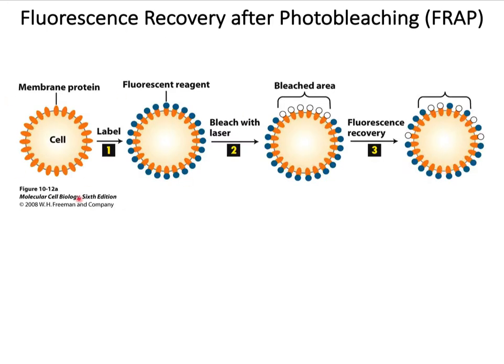This is another example of fluorescence recovery after photobleaching. The cell surface membrane is made fluorescent by a fluorescent antibody or GFP or RFP tagging. See, a section is bleached, and during the recovery, if that protein is motile in the membrane, the fluorescence in that region will recover.